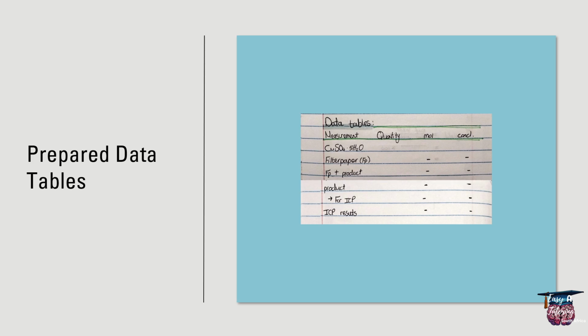Now you'll notice that I also have a moles and conclusion column here. This is typically when you have more than one reagent that actually influences the yield that we will get at the end. You can go and calculate the moles of each of these, and then you need to go and determine the limiting one, and then I just like to note that under conclusion.